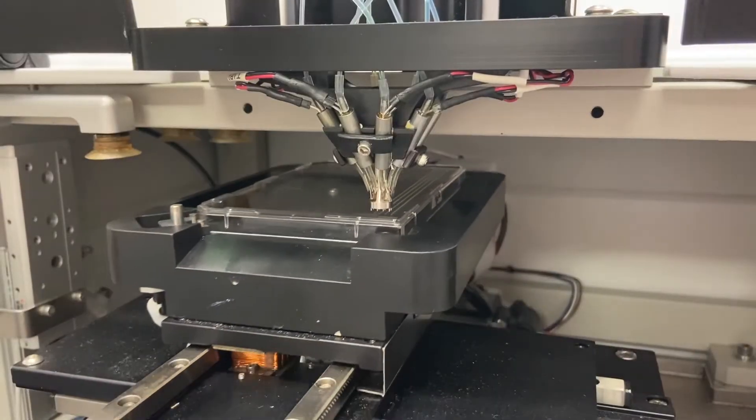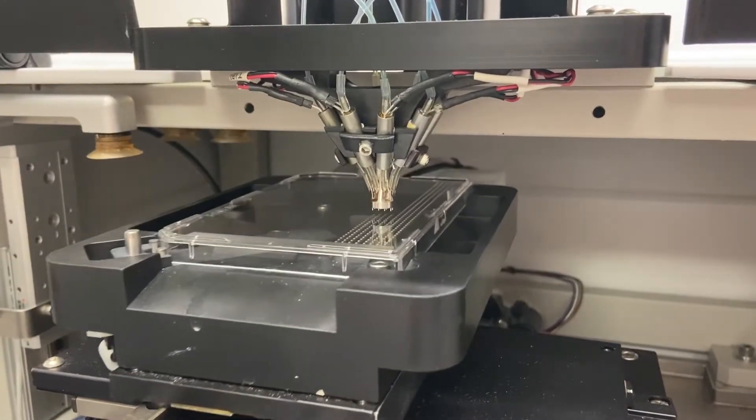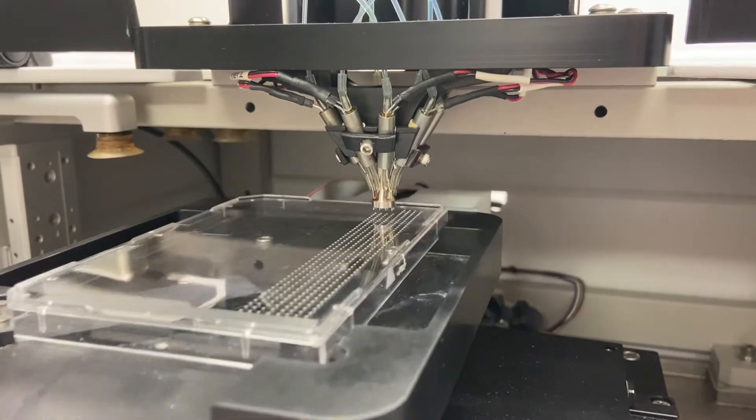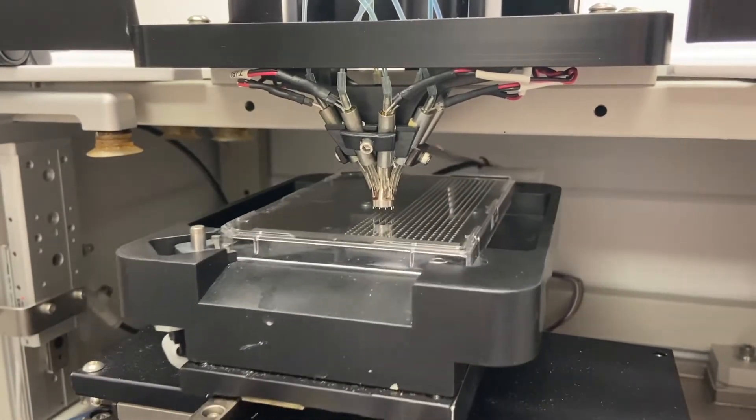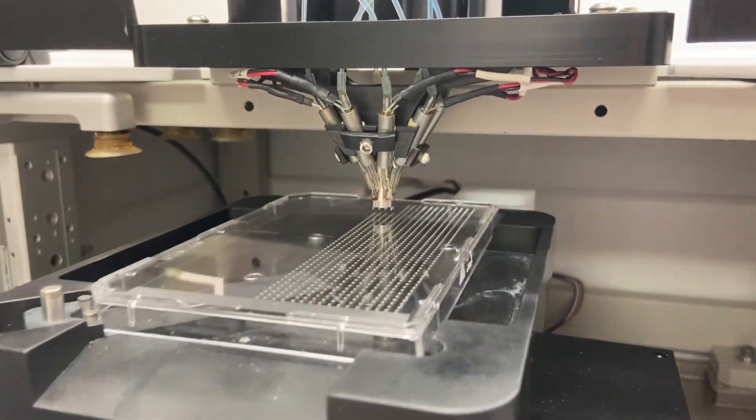Dispenses on the fly for increased speed and offers an 8-channel standard with many options and valve types available for customization.